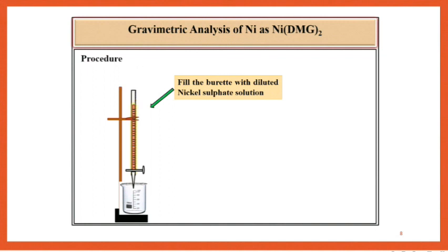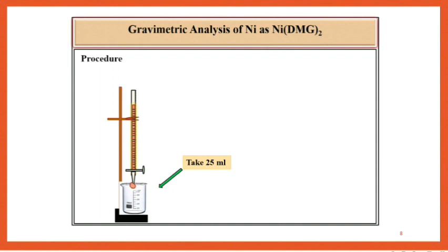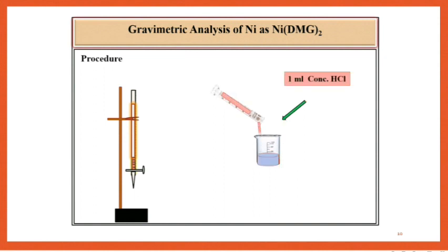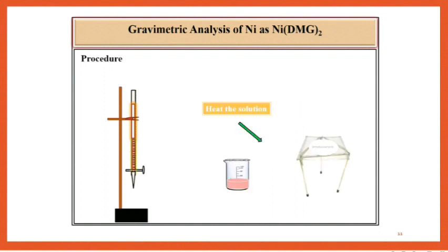From this burette take 25 ml of the diluted solution of nickel sulfate. To this solution add 50 ml distilled water and then add 1 ml concentrated HCl. Then heat the solution to about 80 degrees centigrade.